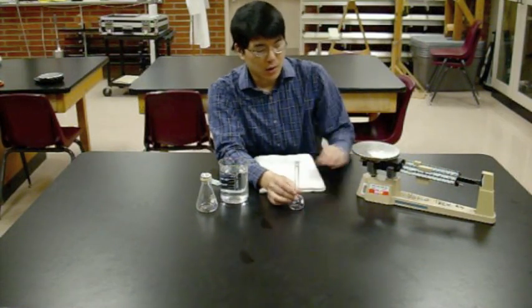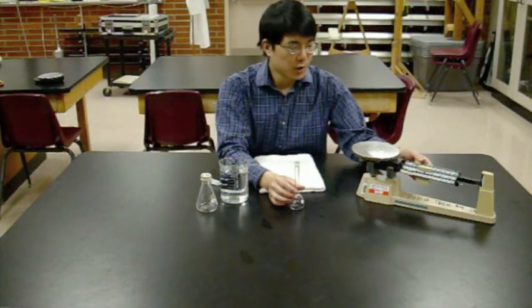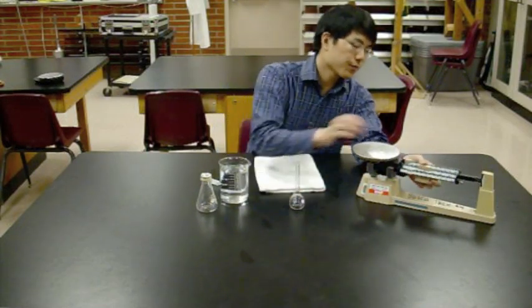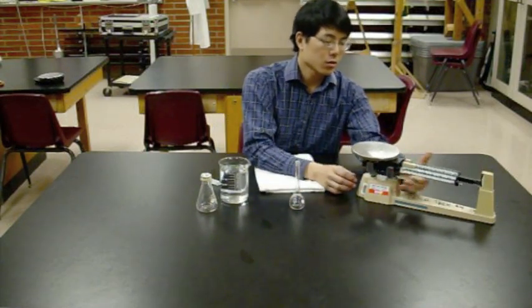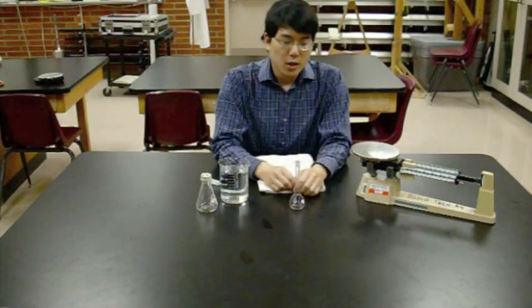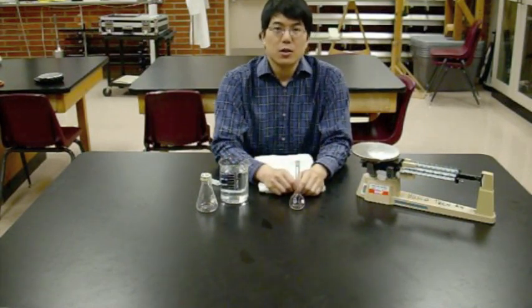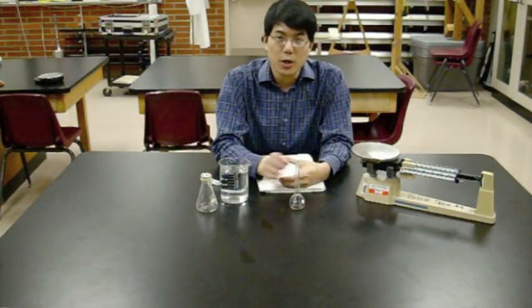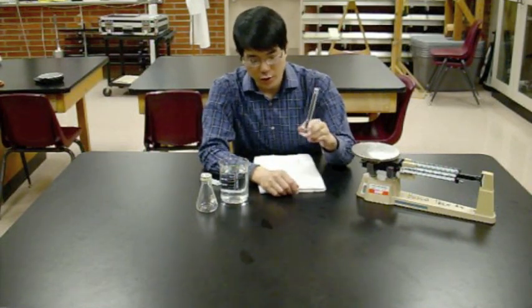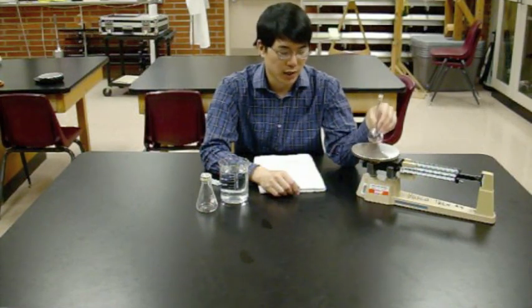In this section of the lab, we're going to be using the triple beam balance. And the reason we're using that is because we're going to be taking some measurements in these two sections, section 2 and 3, that exceed the 200 gram limit of the electronic balance. So start off by measuring the mass of the empty volumetric flask.